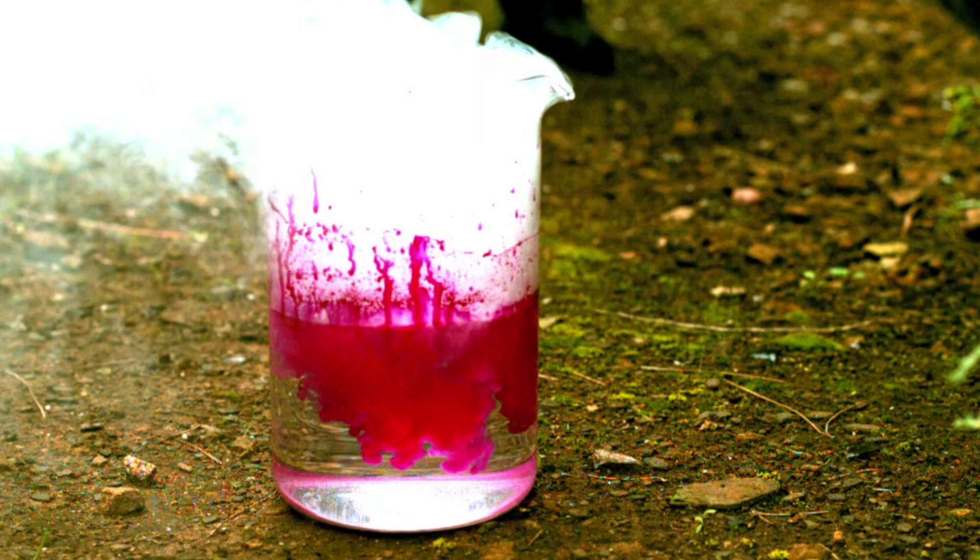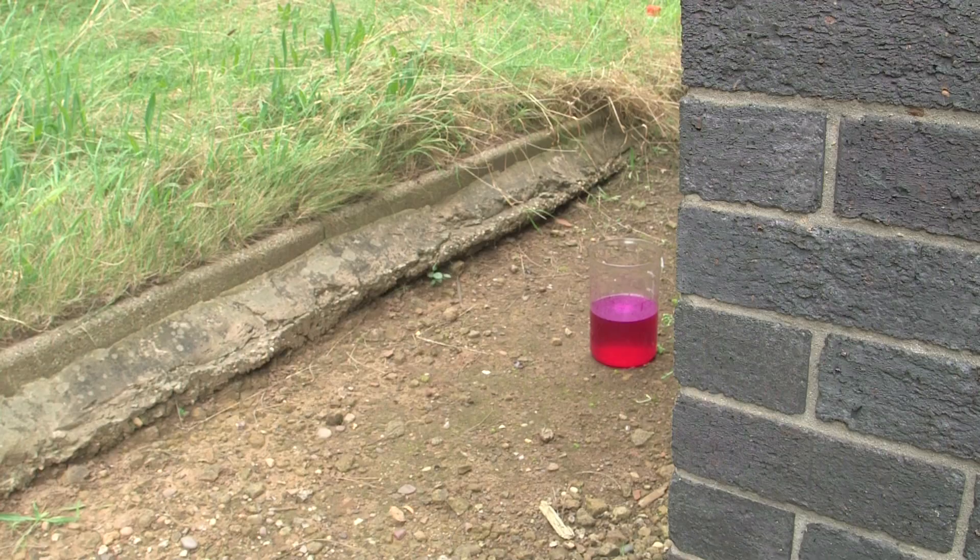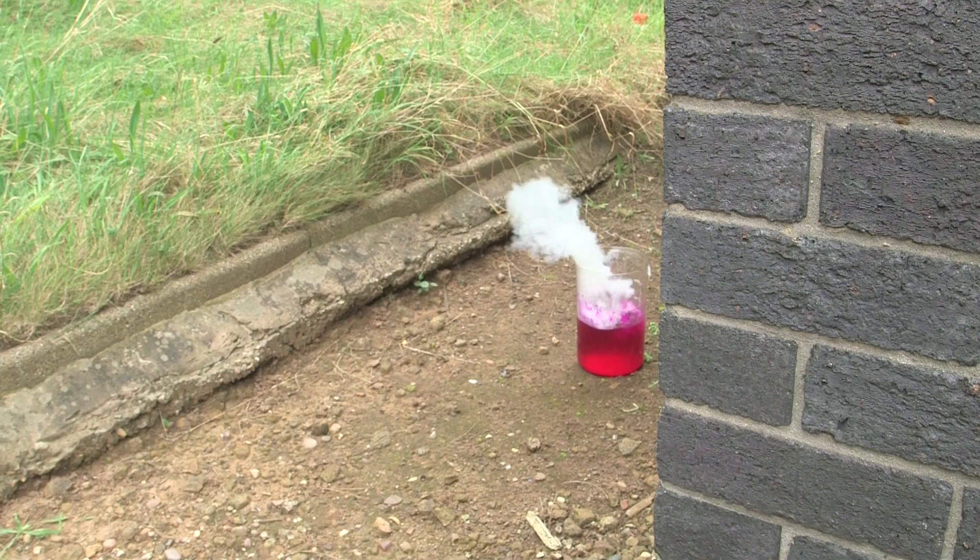Sometimes, depending on the particular reaction conditions, the hydrogen can catch fire and you can get big flames. It looks good, but good chemists shouldn't get big flames.